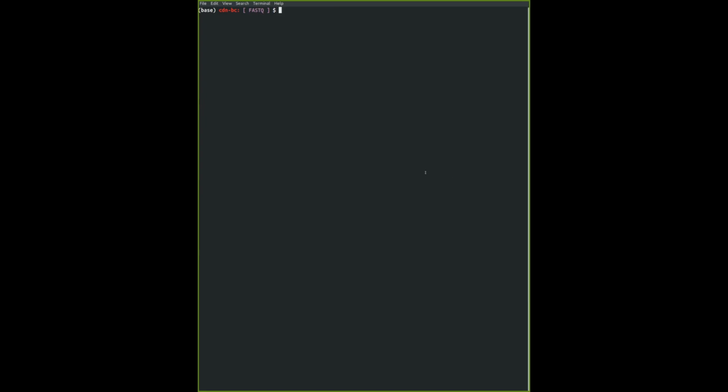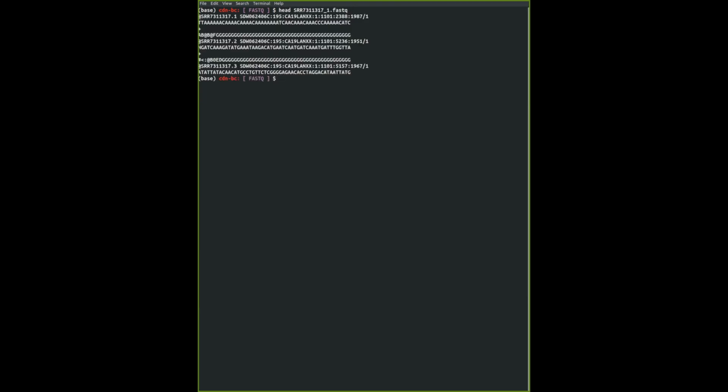Okay, so let's give this a try. You don't really need to paste any answer here. It's more about looking at the text file and seeing if you get something similar. I know the first one might be a little bit tricky, and you might be unsure as to how to go about doing that.